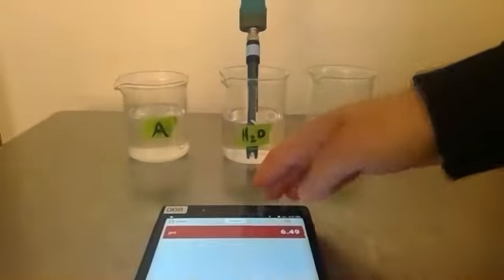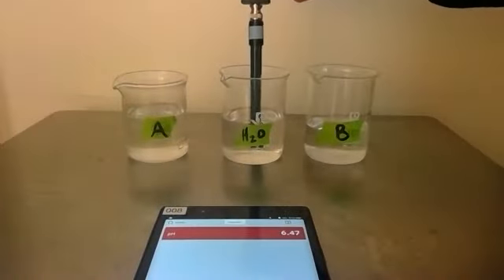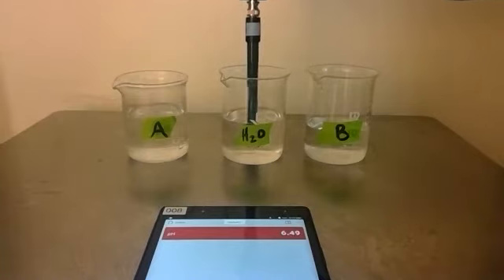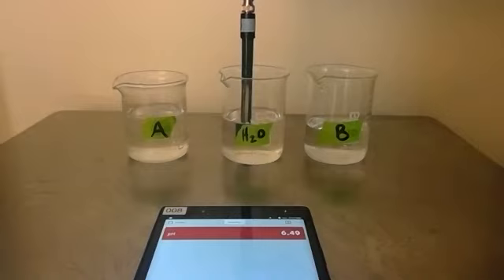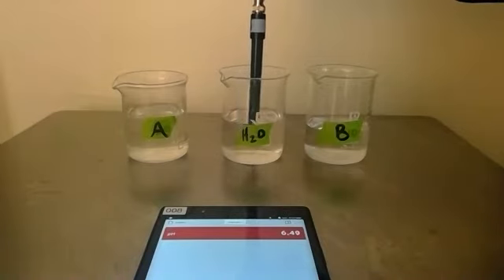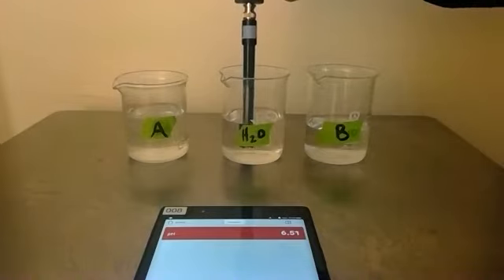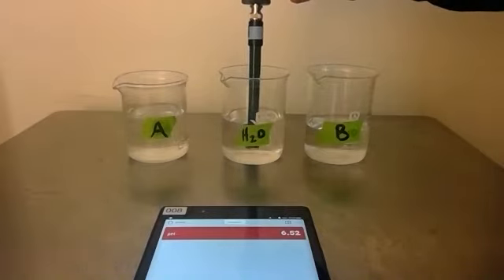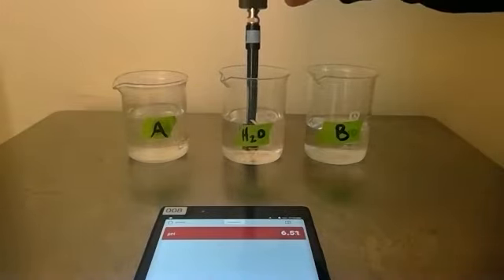That last digit's changing a little bit, possibly because it's up close to the glass. When I take it and put it in the middle it goes back down a little bit, but it fluctuates similar to the way we see a mass scale fluctuate, which tells us there's some uncertainty in that last digit. It's really our estimated digit. We'll record all of them. It is a significant figure, but we're at about 6.47, 6.50, somewhere around there.